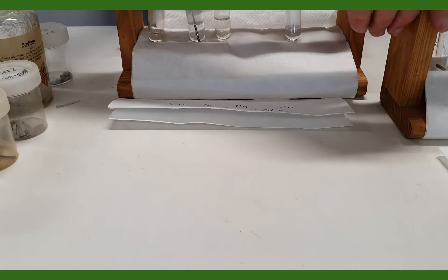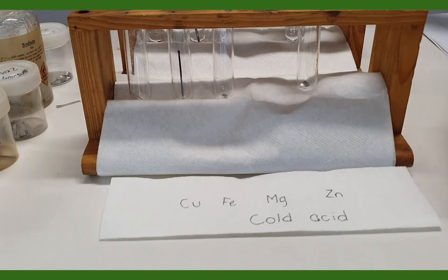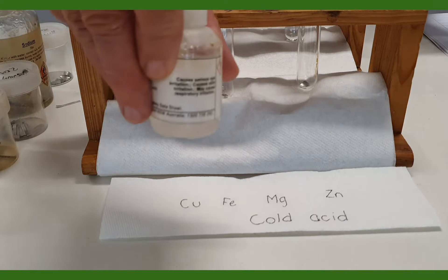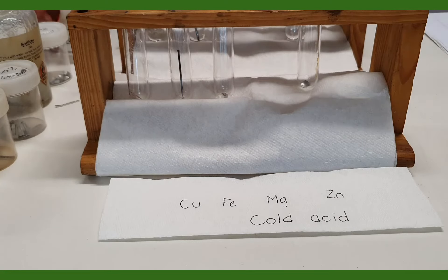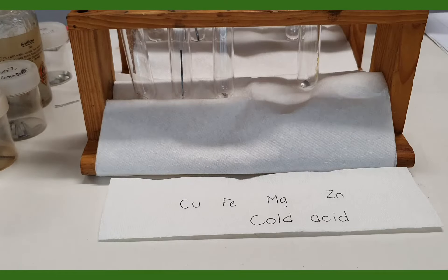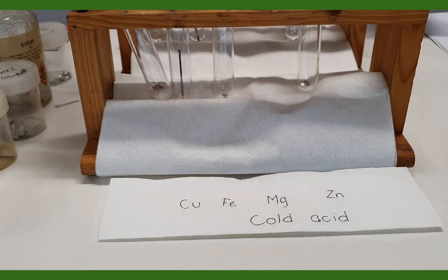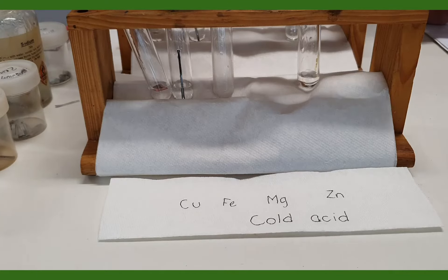Here are our metals, and our cold acid is in this container here, so I'll just add some drops of this. I might just have a match ready in case we have some hydrogen coming off. Here's our acid — hydrochloric acid, 2 molar — and 2 molar hydrochloric acid on iron, then 2 molar hydrochloric acid on magnesium, and you can see a lot of bubbles coming out there.